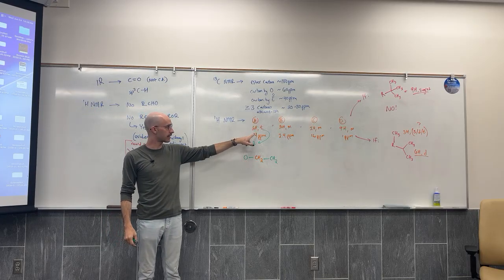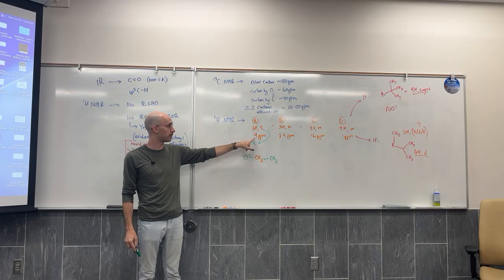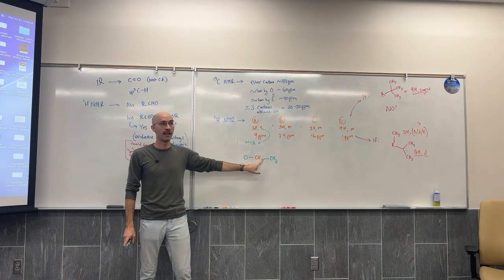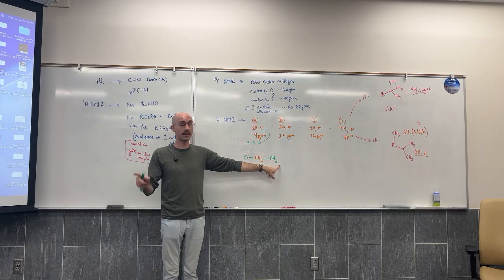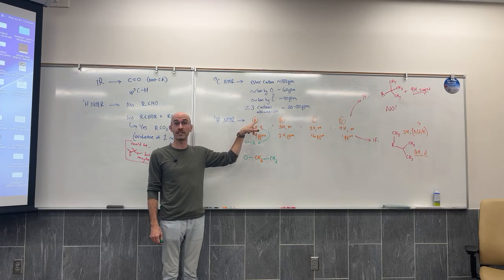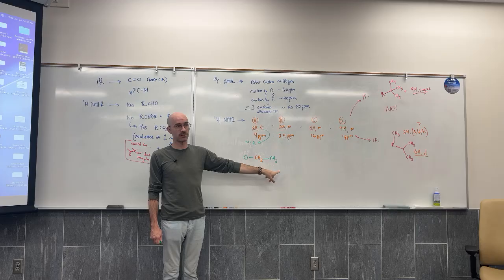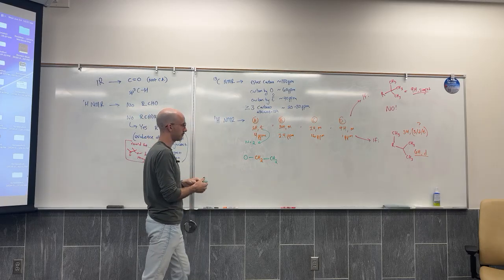I think that this signal comes from hydrogens bonded to the oxygen of the ester because of its chemical shift being at 4 ppm. I think this signal has a CH2 because it is a triplet splitting pattern, so the number of neighbors must be 2. If it were a quartet, the number of neighbors would be 3, and it would have to be next to a CH3. Let's look at our next signal.